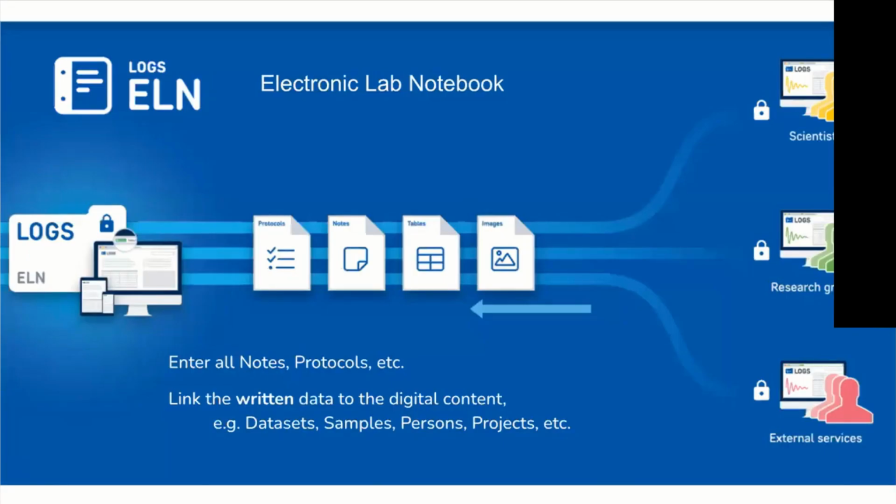So today we'll talk about the data gathering from two sides, one through the ELN, right here with the electronic lab notebook. There's not much to explain here. I think it's almost intuitive. Everybody's used a notebook by hand. I have certainly, and this electronic lab notebook is supposed to replace this with some advantages. For instance, automatically linking maybe to other data, or automatically allowing you to place template text into the notebook and keeping it ready for posterity.